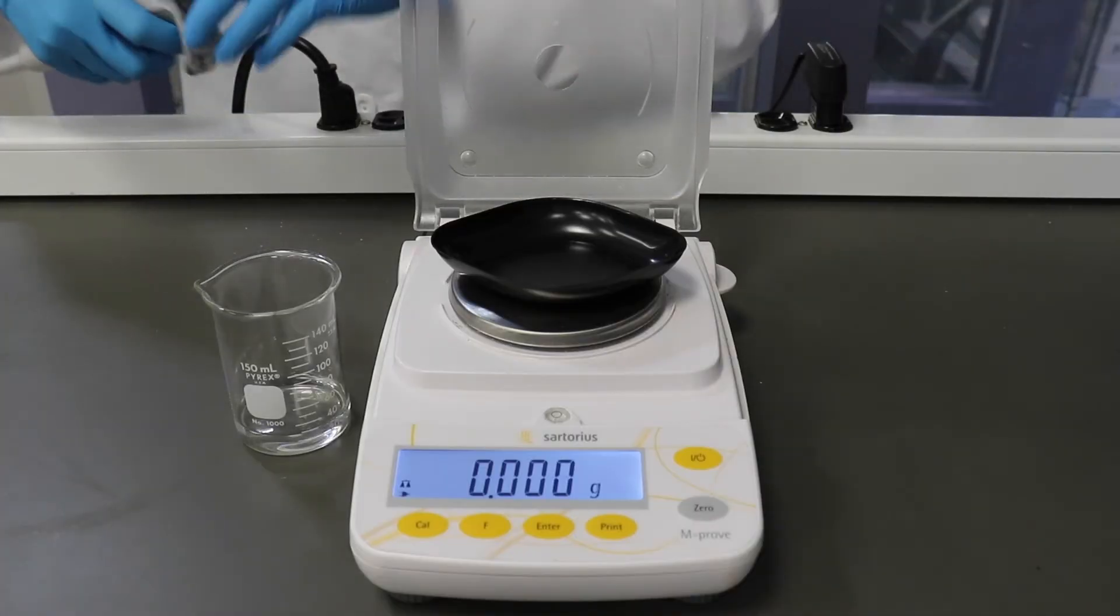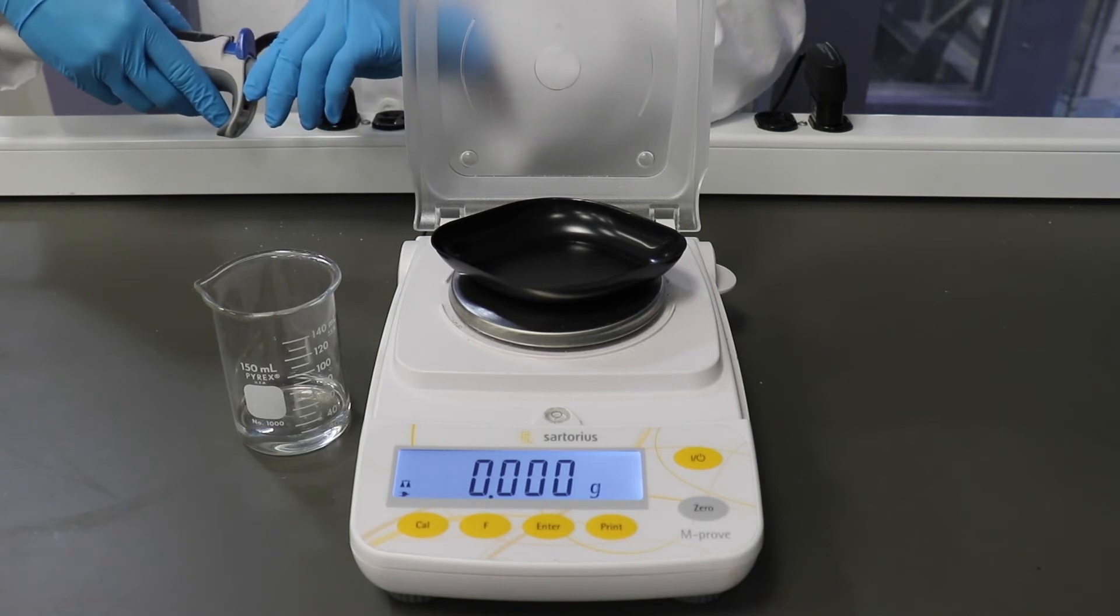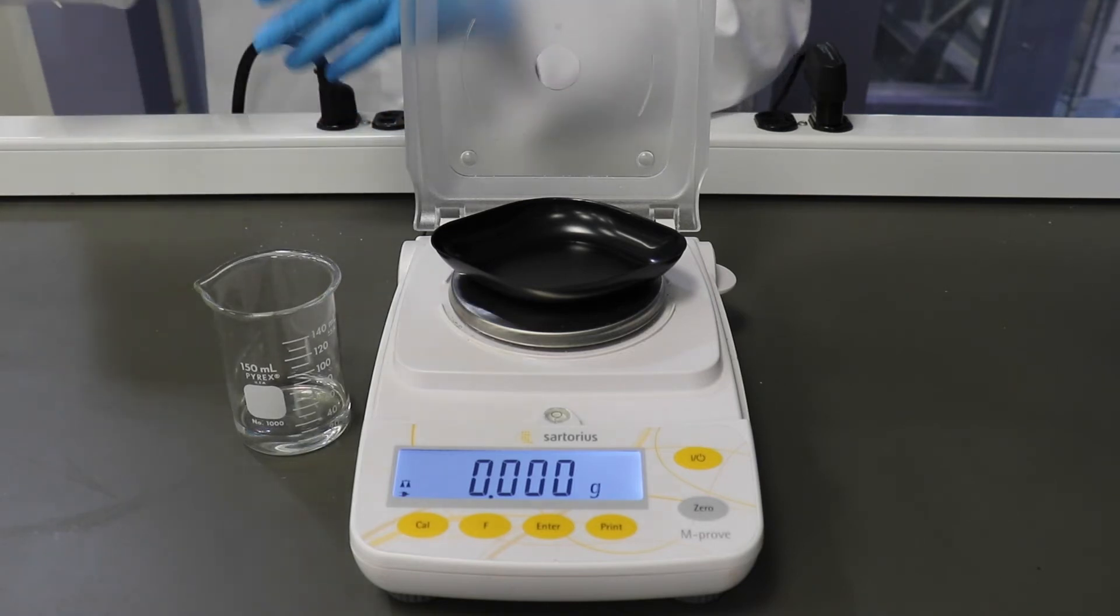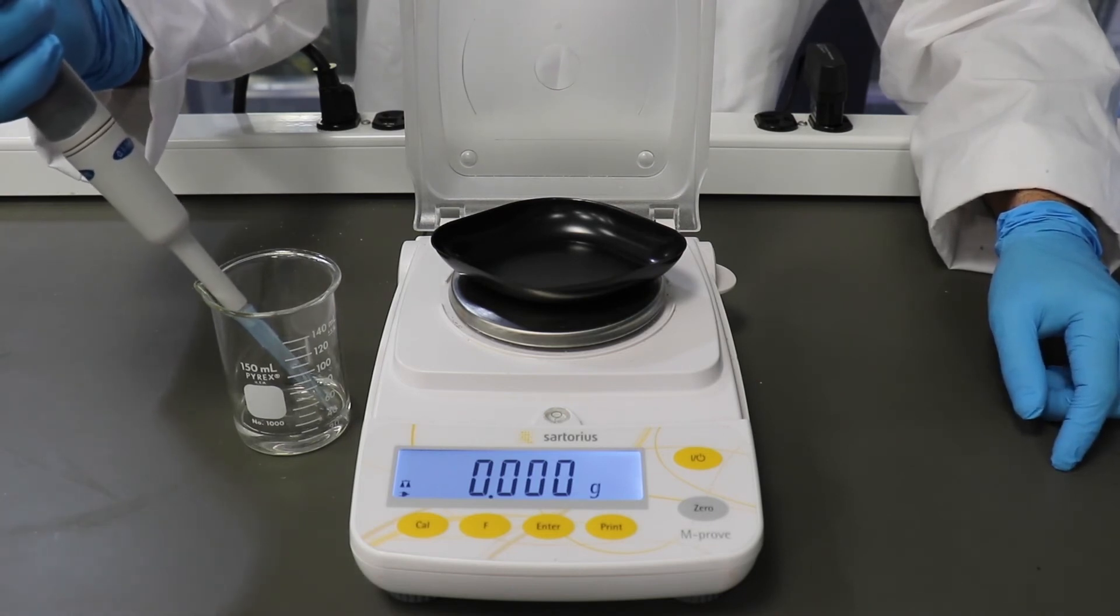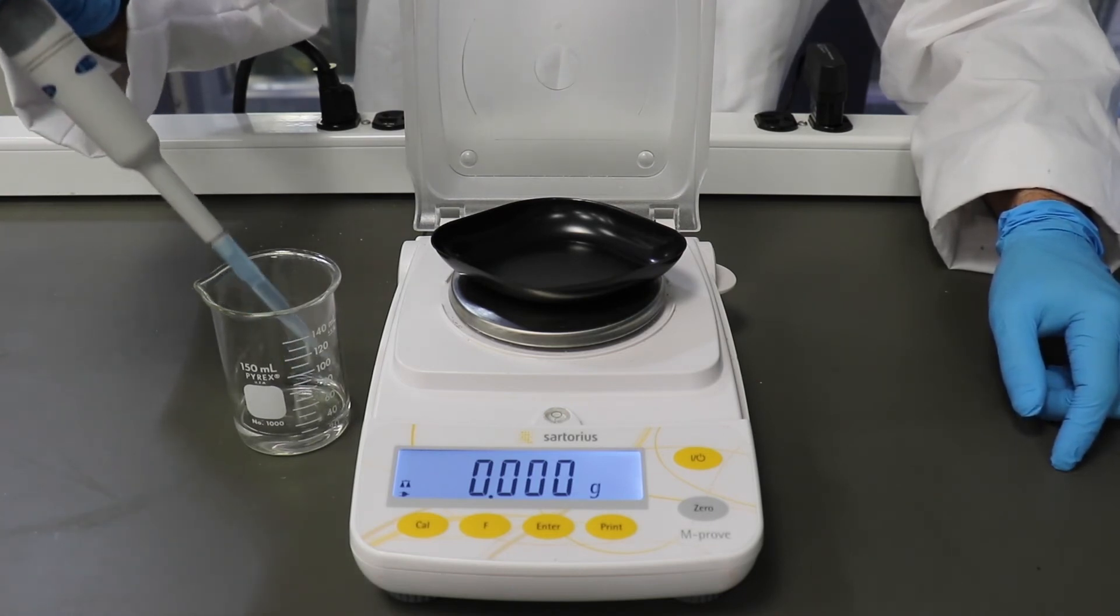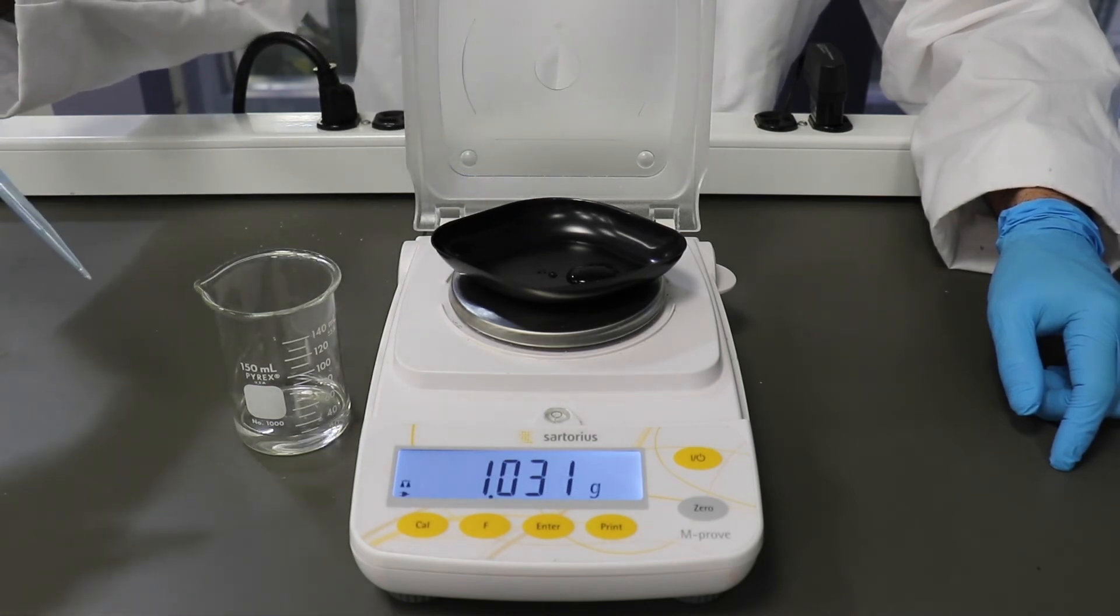Let's test the pipet to see if our adjustment was successful. Reset the volume to the maximum value or a baseline readout that you wish to test. Draw up the liquid and dispense it into the tared weigh boat on the balance. The weight displayed on the balance should approximately match the volume set on the micropipet, plus or minus say 5%.